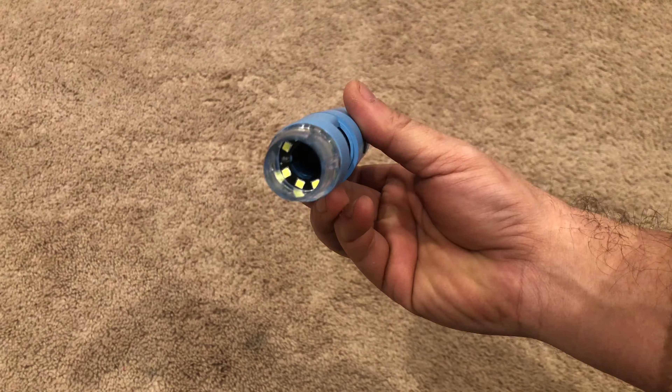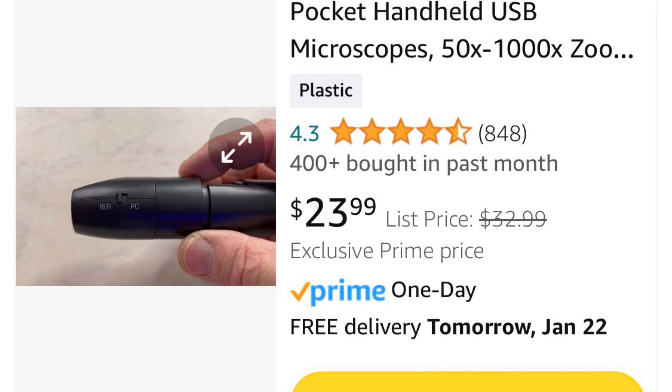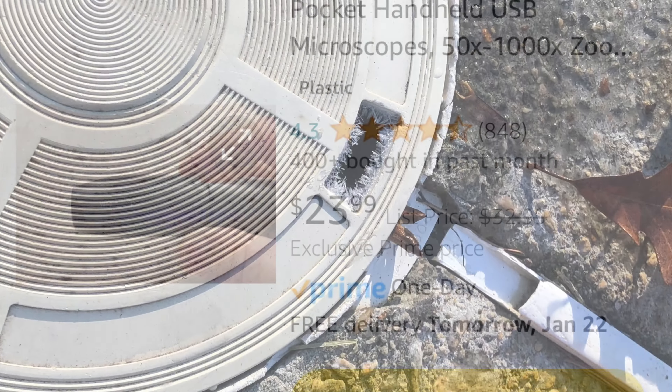Today I'm going to be showing you my digital microscope that I got on Amazon. You can pick these things up for just 24 bucks. It says they can go up to a thousand times zoom — I'm not a scientist so I'm not sure — but I have tested these things out and they do take amazing photos.